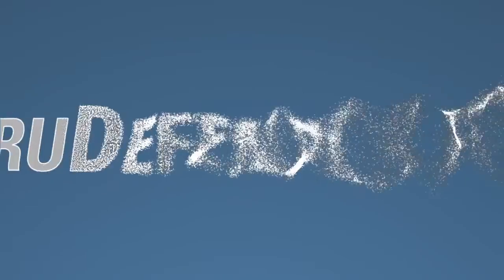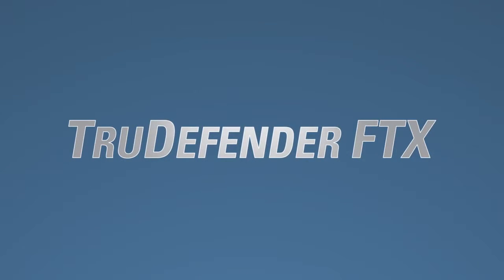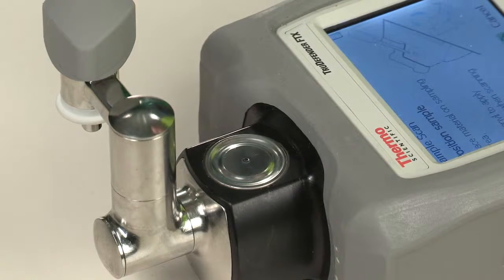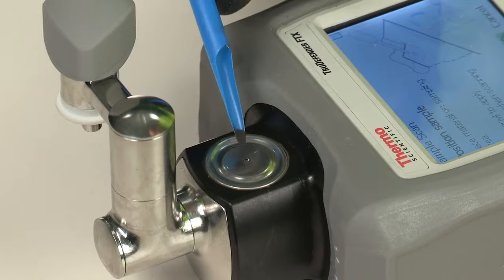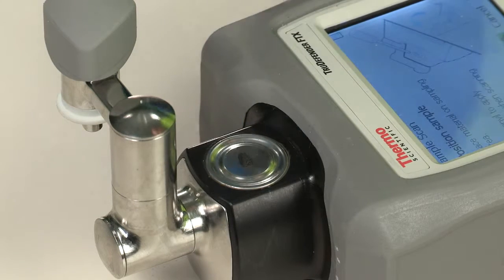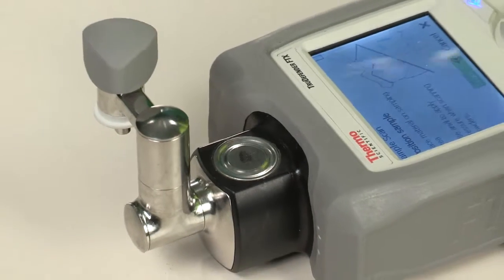Based on the field-proven True Defender product line, the True Defender FTX analyzer is the latest in our family of handheld, rugged FTIR tools for chemical ID. The True Defender FTX includes a new anvil sampling head engineered from the ground up for better sample control and easier decontamination.